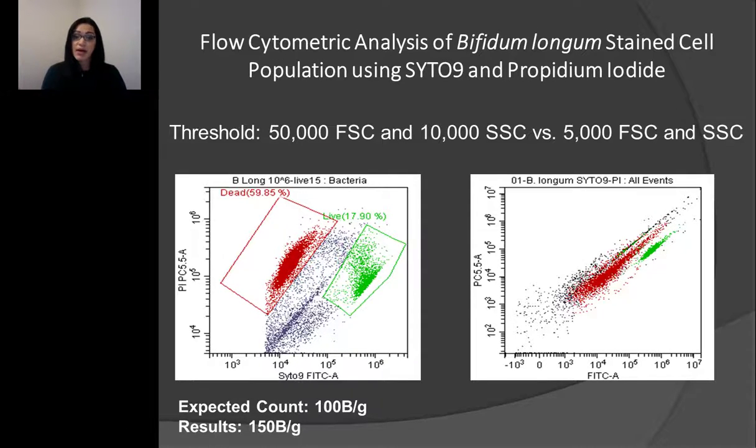After several trials, I figured that doing this treatment for the sample prep provided me better results than just going straight out and making the dilutions and staining the samples, because first of all, sometimes it presented too many particulates other than the cells, and it also required a lot of fixation with formaldehyde.